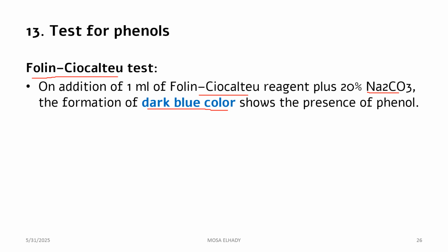At the end, as a takeaway note, general phytochemical screening is a process of identifying the presence of secondary metabolites in plant extract using feasible and cost-effective methods, and the principle of general phytochemical screening is based mainly on change of color or formation of precipitates or both of them.